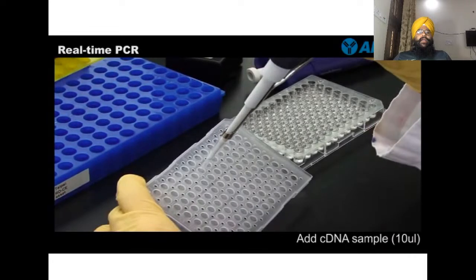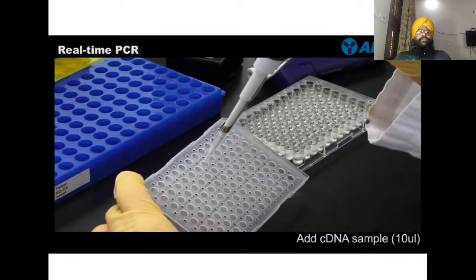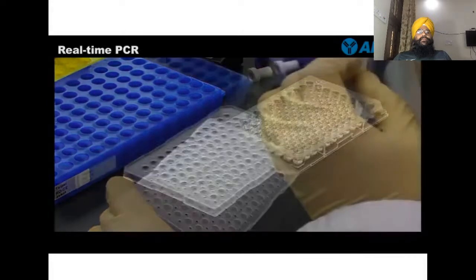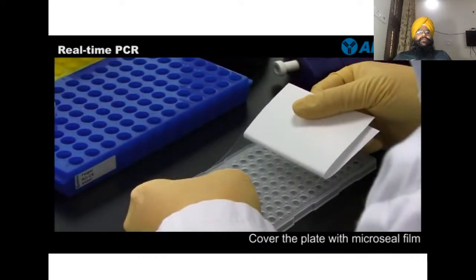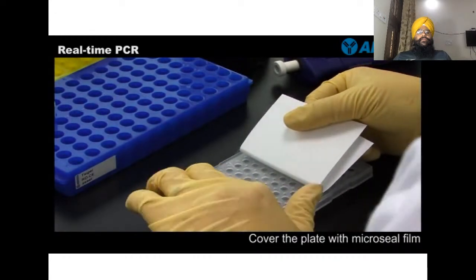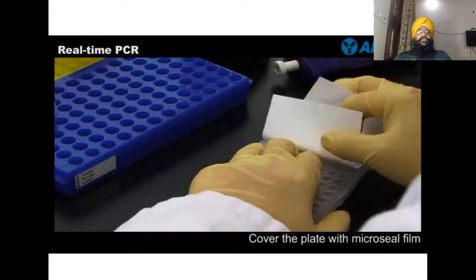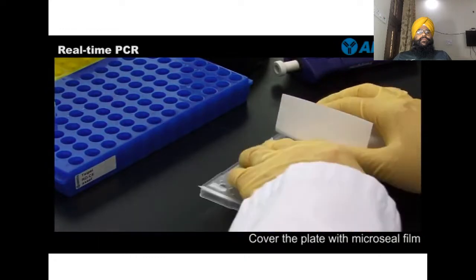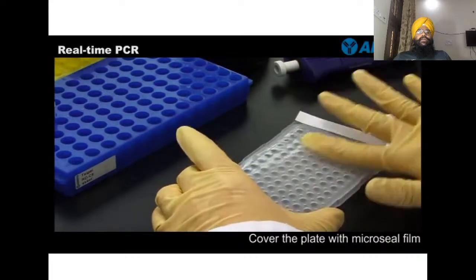Complementary DNA sample, 10 microliter. Then cover with the microseal film tightly so that the mixture is not going outside.